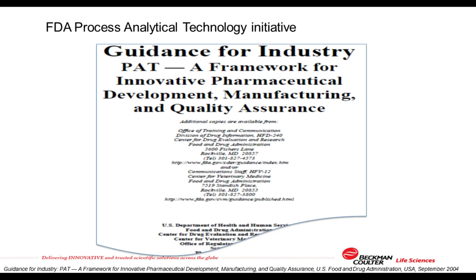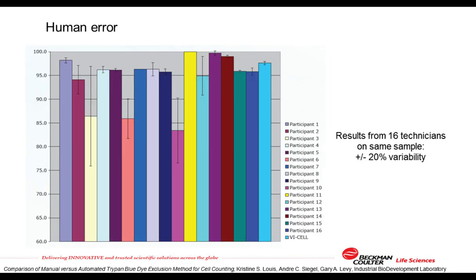As the online instruments are automated, their use makes the testing more robust by avoiding human error and thus improving data integrity and, at the same time, reducing QC department costs.